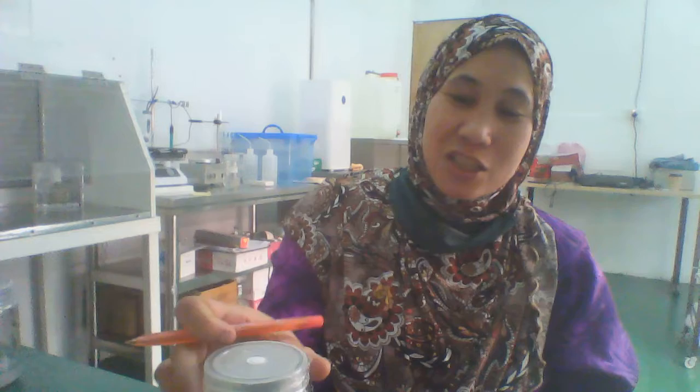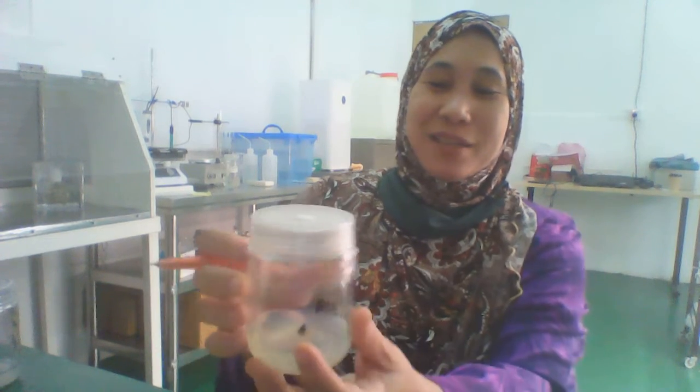So I got one of it which is not so severely infected by the fungus, and I changed it into this media, MS plus 5BA, and I don't know how it goes. So today it looks like after one day the fungus still did not come out, so hopefully it doesn't come out in another 2 weeks, and we'll see whether it will grow or not.